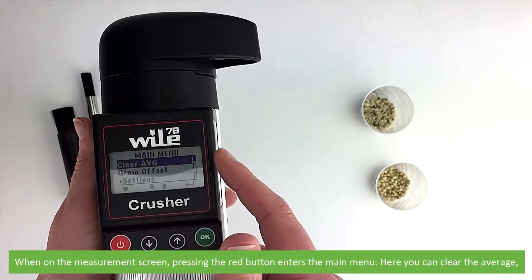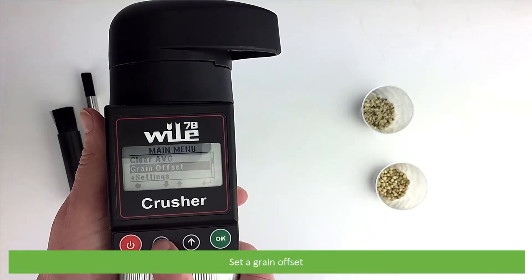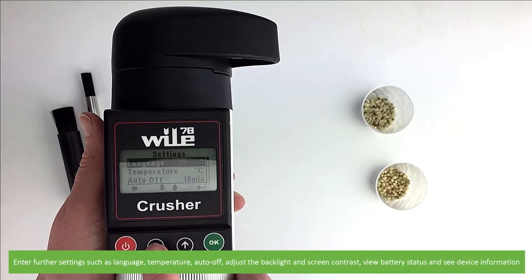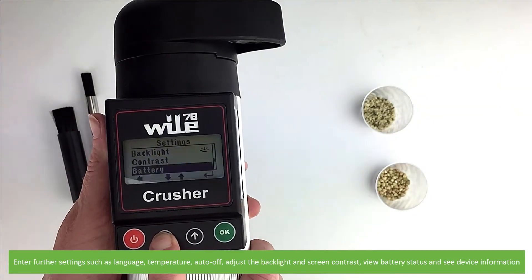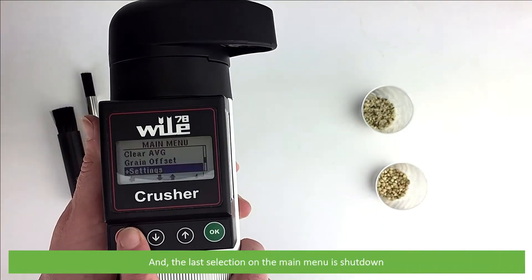When on the measurement screen, pressing the red button enters into the main menu. Here you can clear the average, set a grain offset, enter further settings such as language, temperature, auto off, adjust the backlight and screen contrast, view battery status, see device information, and the last section on the main menu is shutdown.